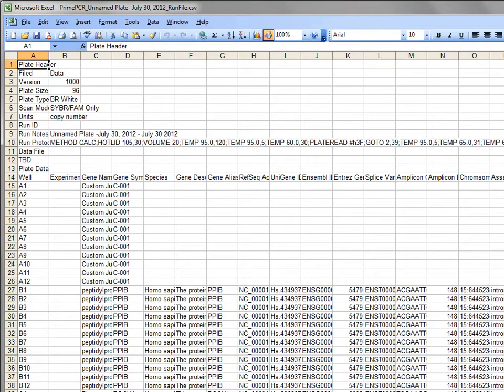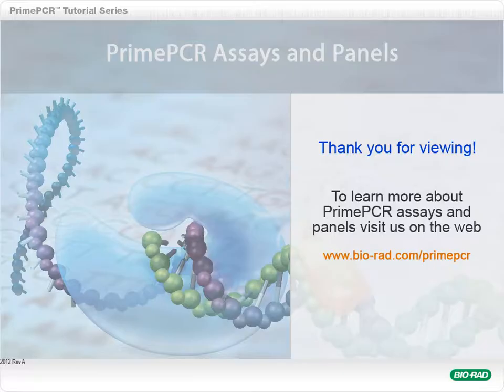When imported into CFX Manager, this file will automatically populate the plate layout. This concludes the tutorial on building a custom plate using a suggested template.